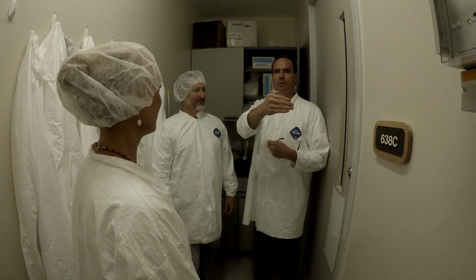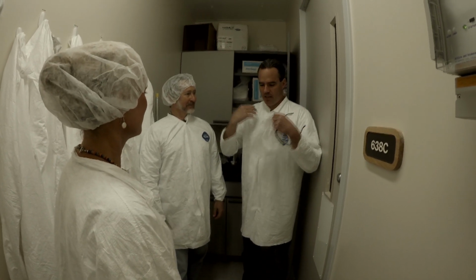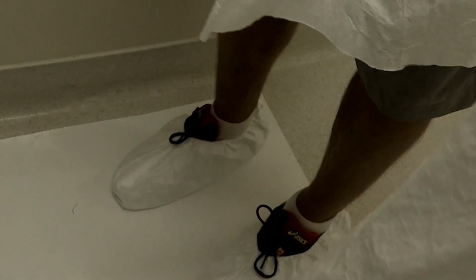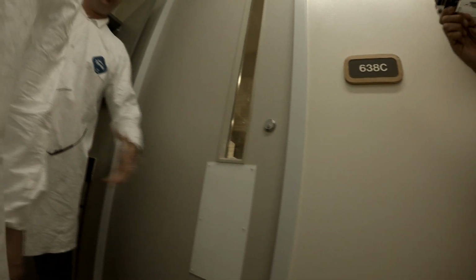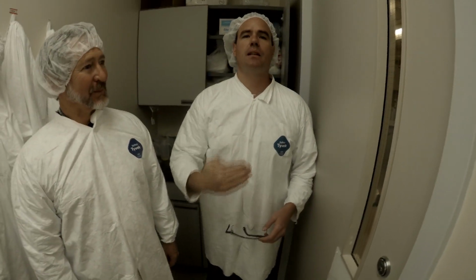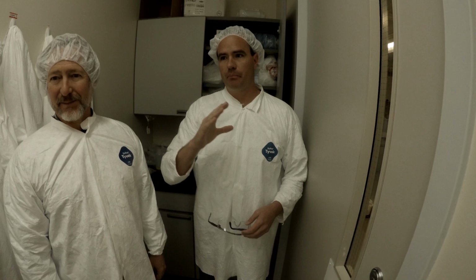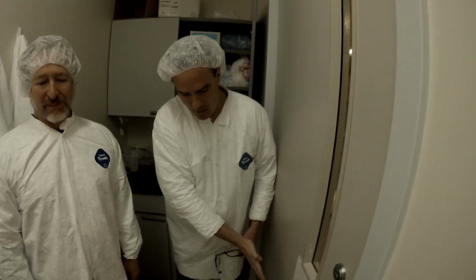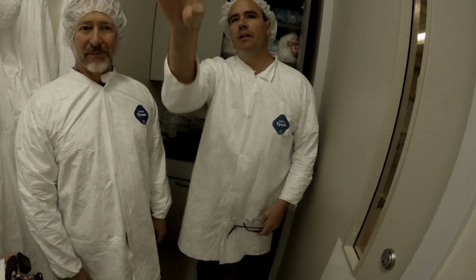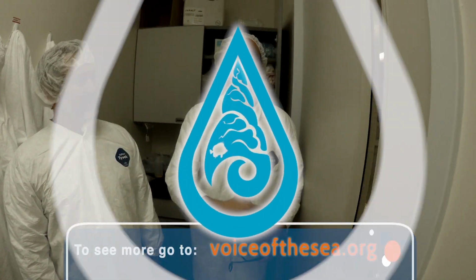So there's a line past which we do not wear shoes. Then once we come in here, we always gown up and get ready in this room before heading in there. And we always be sure to step here on the sticky mat so that whatever particles are on the bottoms of our feet and of our booties get taken off, and so that we don't take them into the lab. Also, in every room in the lab, there will be one of these, which basically describes the air pressure. The thing that makes the clean lab so clean and allows it to stay so clean is that the inside is at a higher air pressure than this room. So any dirt that does fall to the floor gets swept out by air moving underneath the door, and this room is higher in pressure than the one out there, and the one out there is higher than the hall. So as you go in farther and farther, it should get cleaner and cleaner.